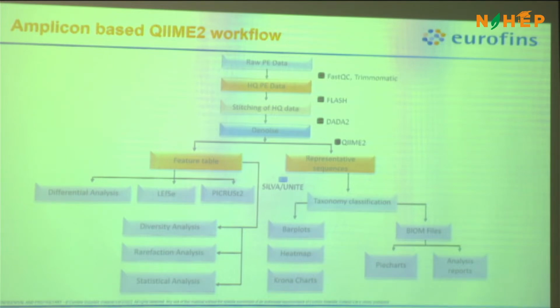Once we have sequenced the entire data, we get the raw data, which is your FASTQ file, from the sequencing machine. Now, if it is a MiSeq sequencing machine, we get 2 x 300 read length sequences, which we go ahead and filter. So you can see there is a filtration step.